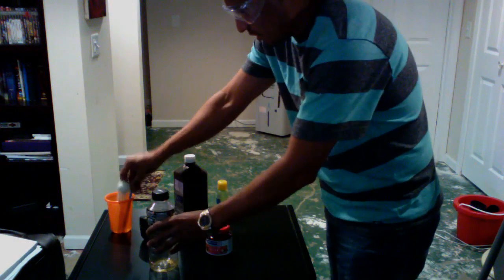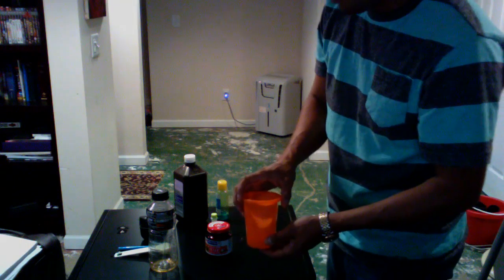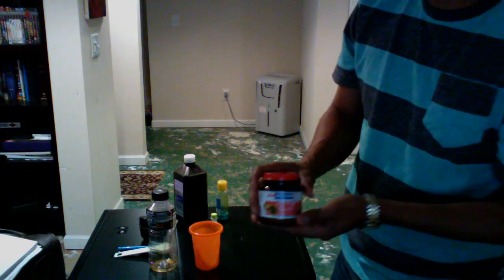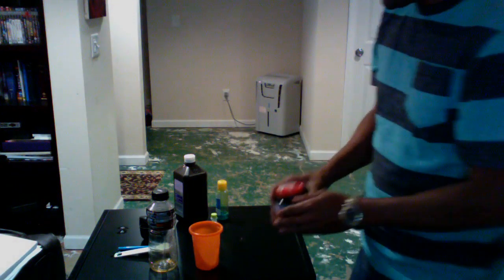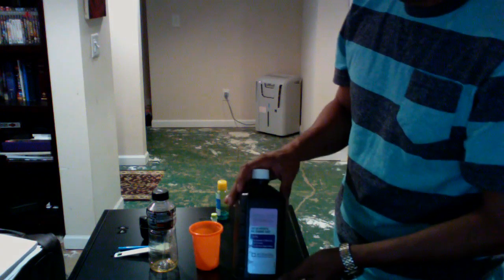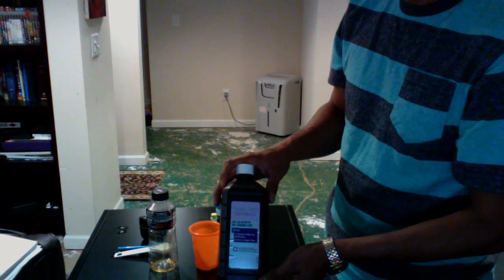And now over here, inside of this cup, we have hot water. And the hot water is going to mix with the yeast. Now the yeast is going to be our helper. Why is that going to be our helper? Because it's going to be our catalyst. What it's going to do is take the extra oxygen. The formula of the hydrogen peroxide, H2O2, has an extra molecule of oxygen.